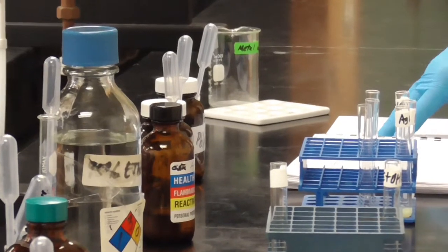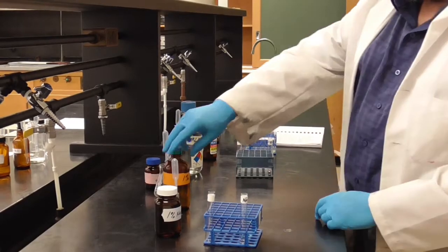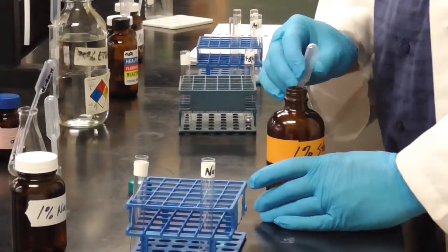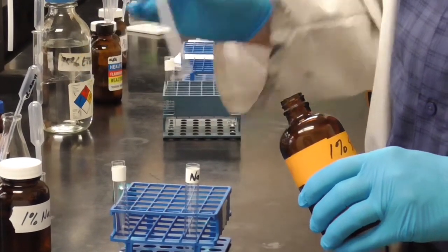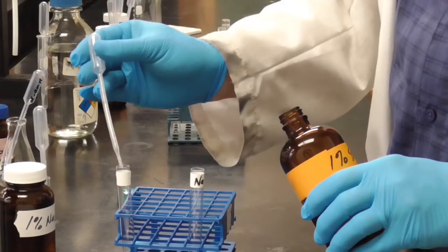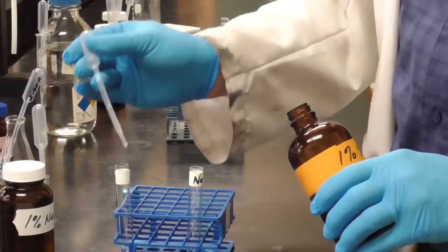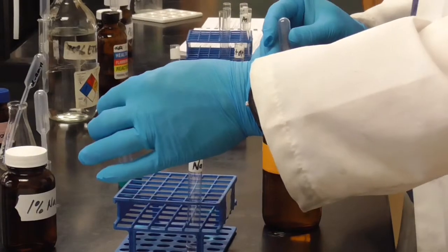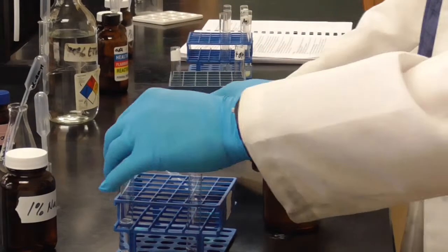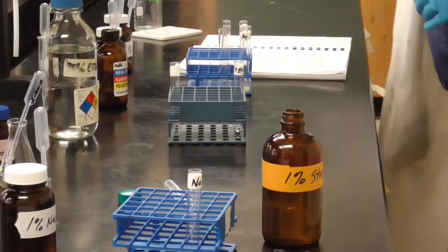Place 3 milliliters of 1% starch in a second test tube. So as usual, our starch, our substrate, our reactant, we need 3 milliliters in a separate test tube for each. 3 milliliters there. That does not look like 3 milliliters. I think I may have done something wrong on that. I'm going to pour that out and try again, for waste.